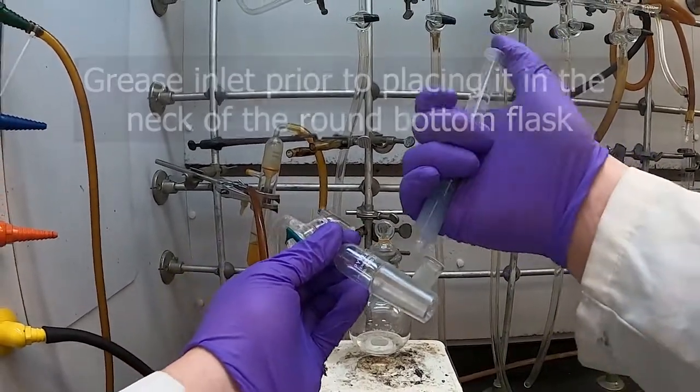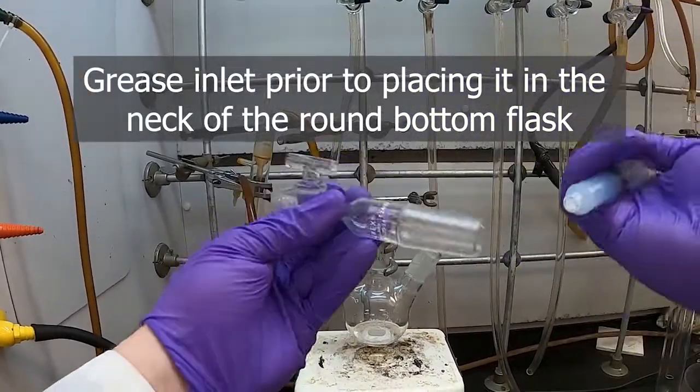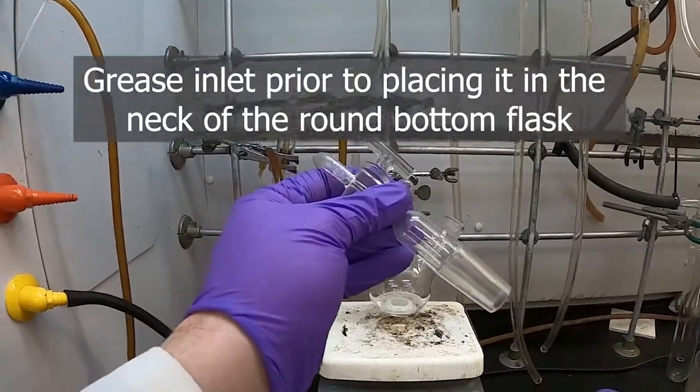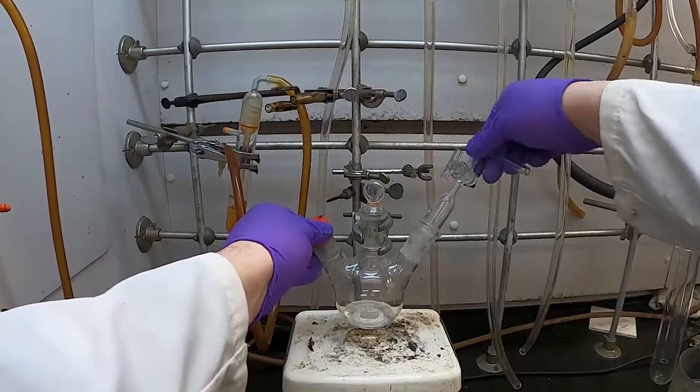So now we will grease our ground glass joint here. Should be just fine. Just a little bit here and there. We'll insert it.